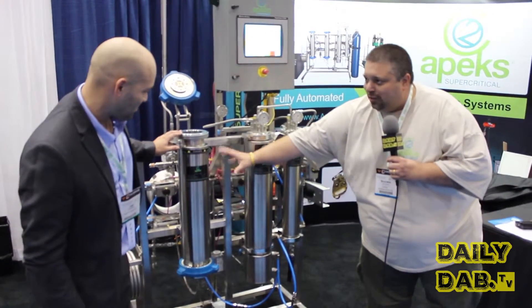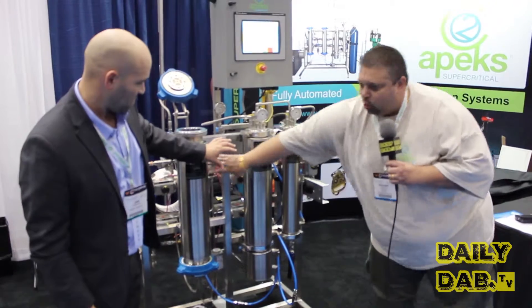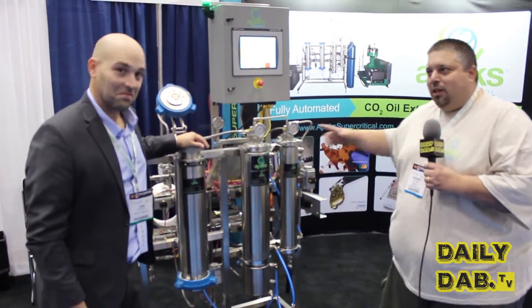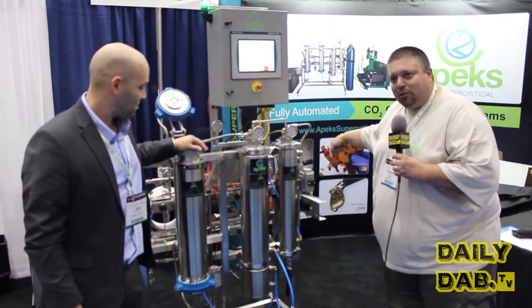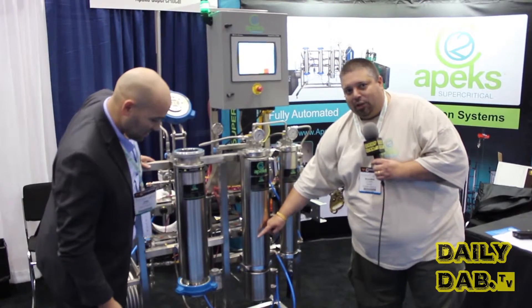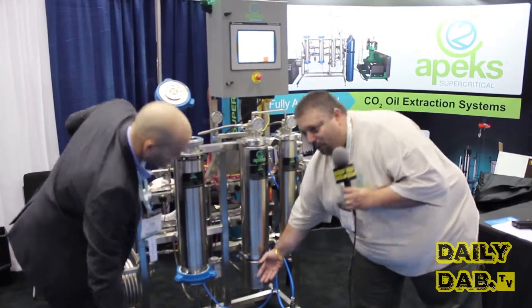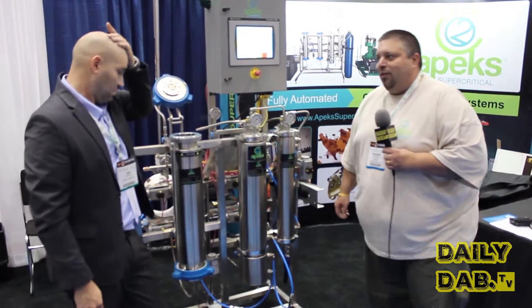We're taking that CO2 liquid cannabis mixture, bringing it over here — 1200 PSI over here, dropping to 300 to 400 PSI here. The CO2 liquid flashes back to a gas, gets recaptured, put back into your CO2 tank at a 95% recapture rate. You have a tube going down through here with an orifice at the end that creates a cyclone spitting out oil. Your collection comes down here. After six hours, you have basically around 110 grams of crude oil out of the system.